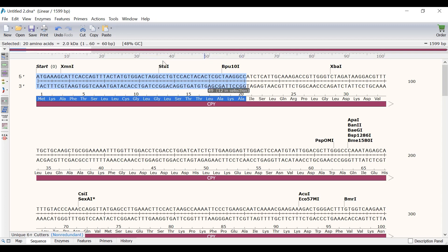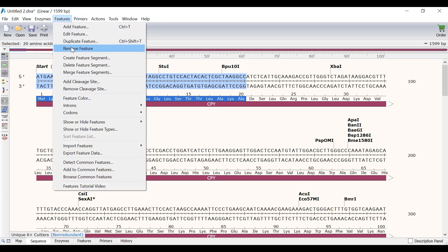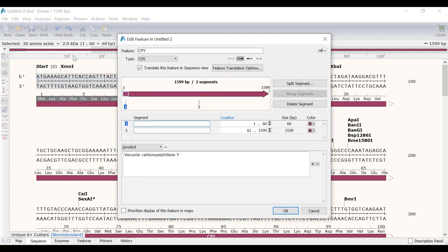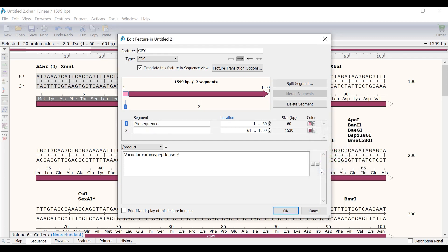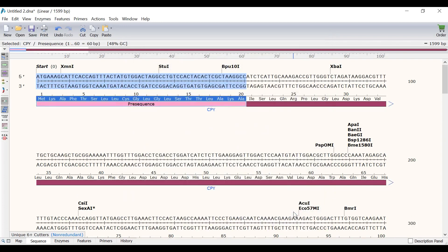This will select the region I am interested in. Now I will go to Features, Create Feature Segment. Notice that the CPY feature is now split into two segments. In the first segment, I will call this pre-sequence. I will also change the colour of this segment to a rose colour, so it can be differentiated from the other segments in the feature. Finally, I will click OK to create the segment. Now the pre-sequence is clearly indicated.